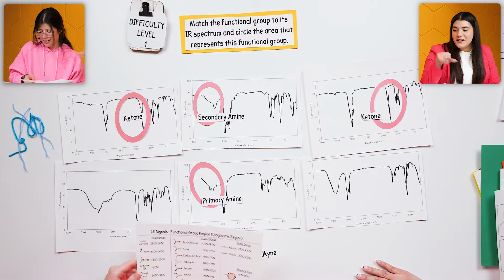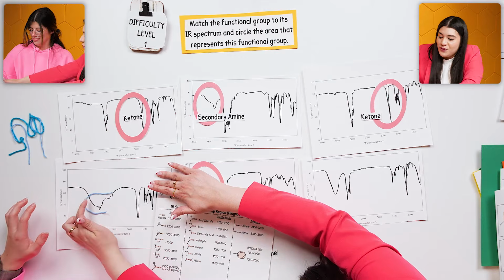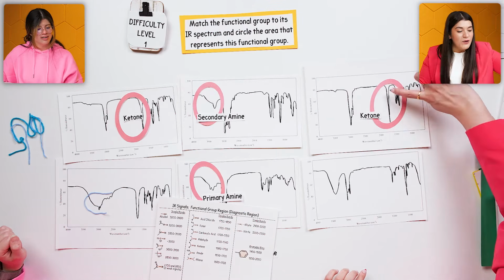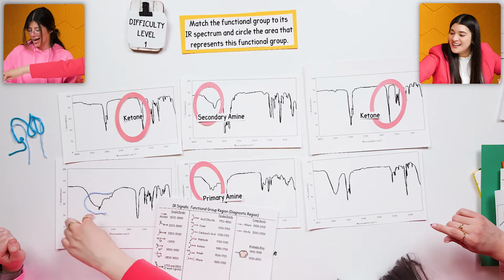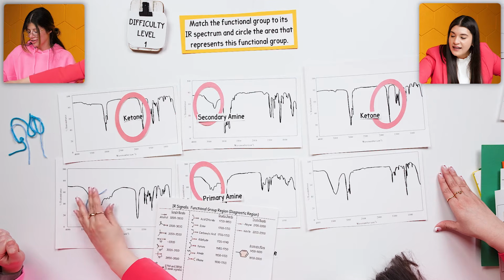Circle the little area that you're talking about. I would actually say it's here. So we want this little group, this is the broad portion. And by broad, it's really saying, this was narrow. Broad is kind of chunky, it has that kind of shape to it. Concavity. So this is the little area that we're looking at.